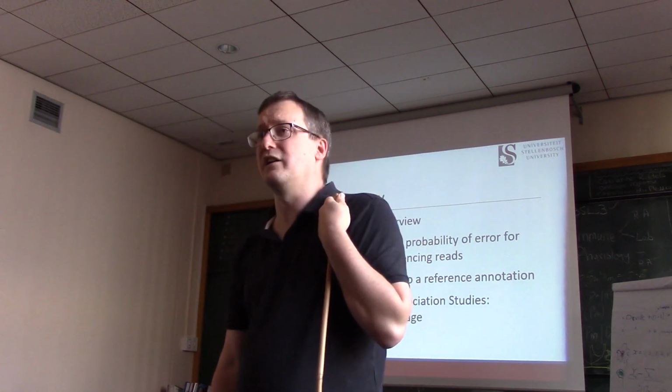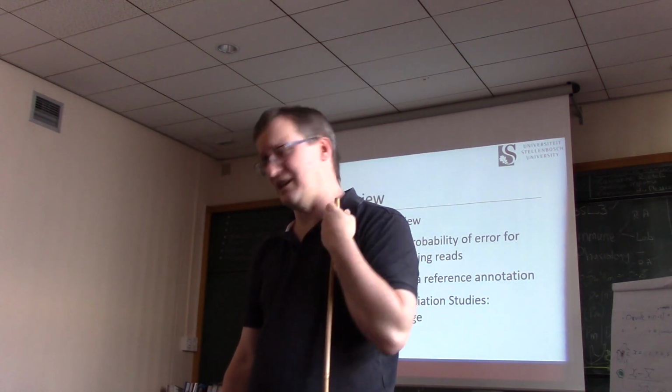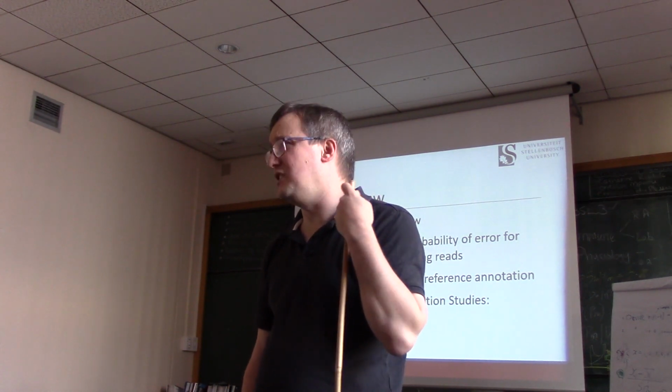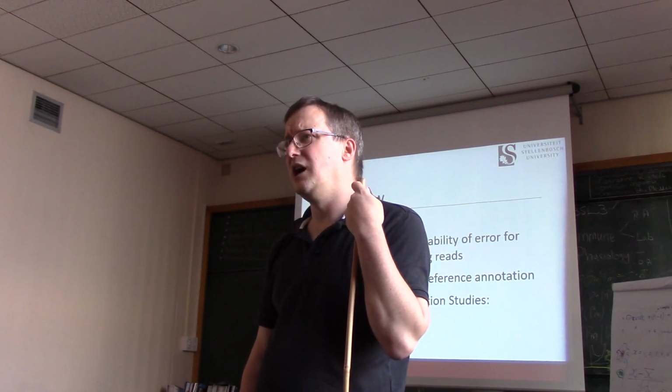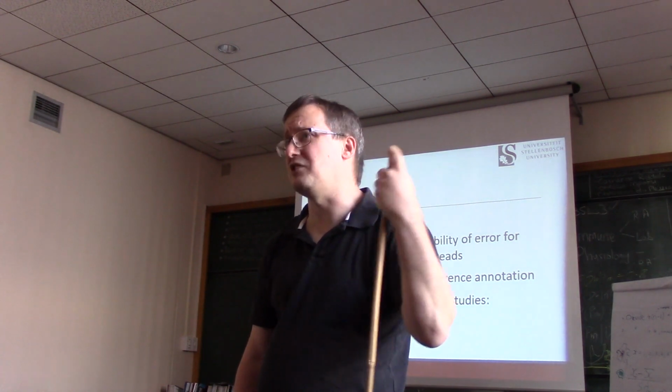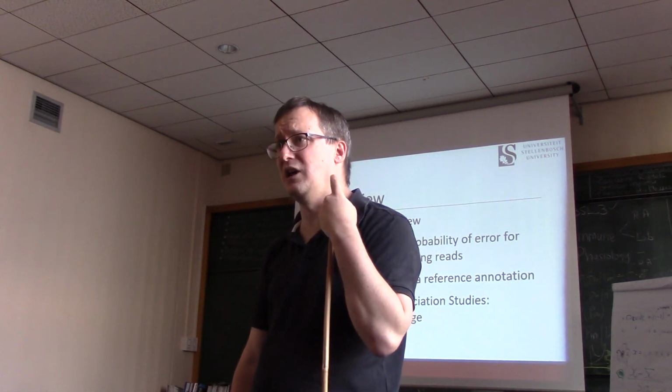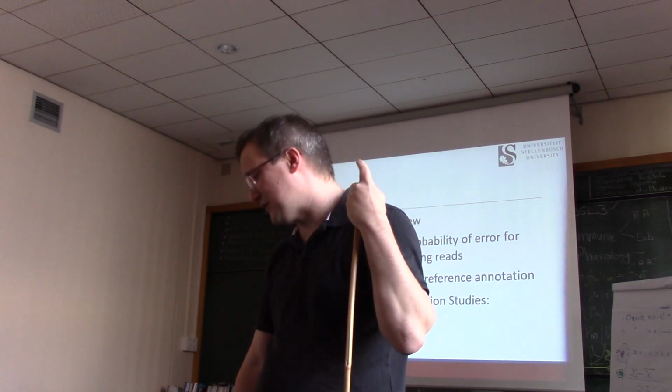And from that, we're going to talk about 3 big bioinformatics areas. One of these is Phred, which is a technology that's been around for quite a long time. And even if we don't use the original software to produce Phred scores, the concepts behind Phred scores are very much alive. So we're going to be talking about that.